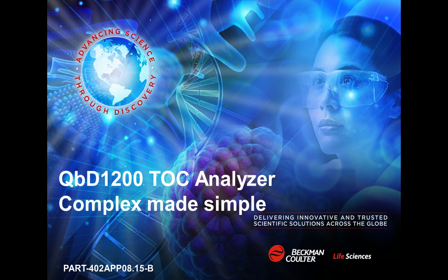But if you're using a QC laboratory TOC analyzer to provide data for the batch release file, then it should be validated for that application, and that's where ICH-Q2 comes in. It provides sufficient evidence that's acceptable to the regulatory inspectors from the United States, the European and the Japanese regulatory bodies that the QC lab analyzer is fit for that use.